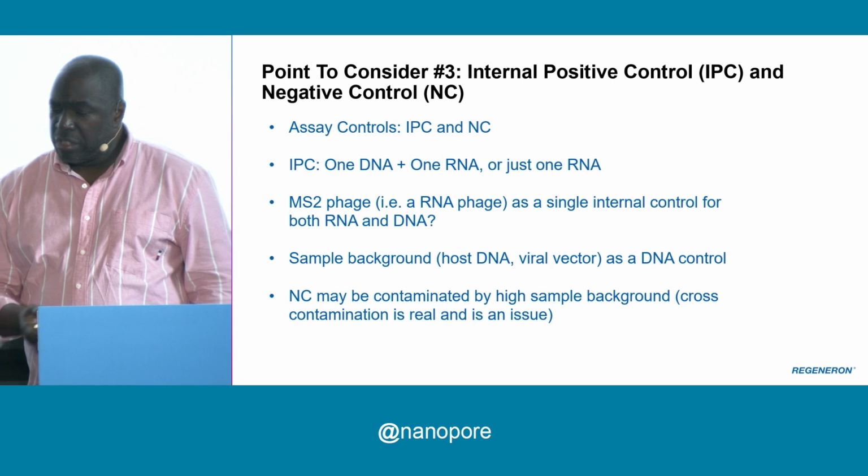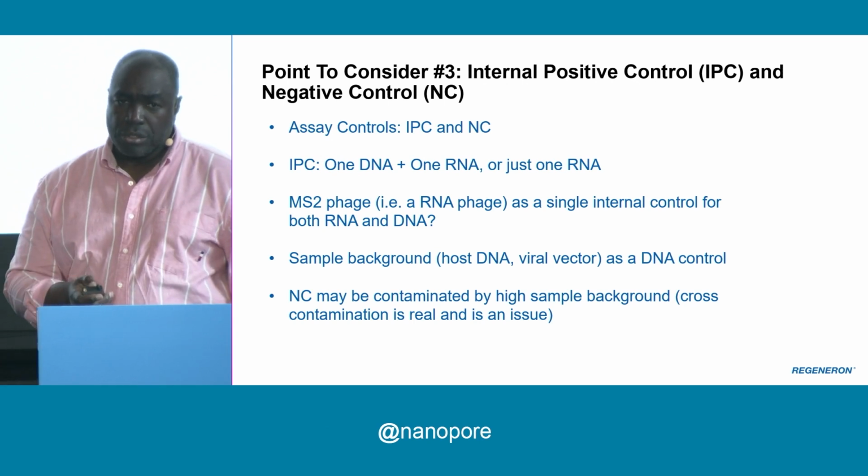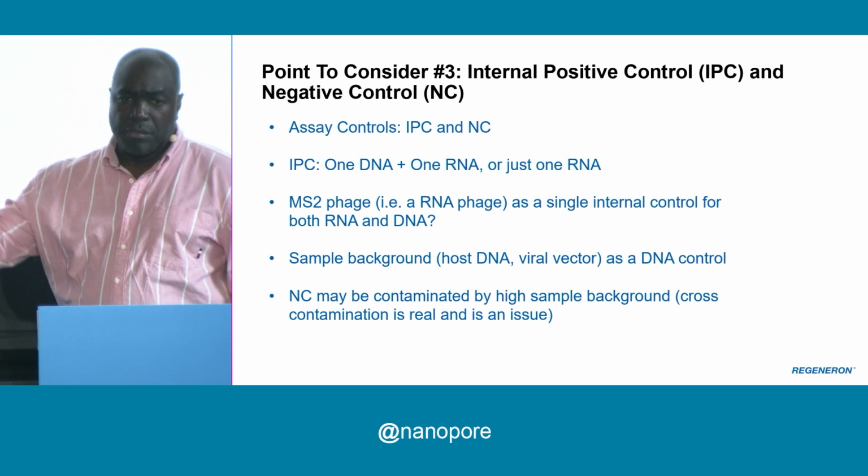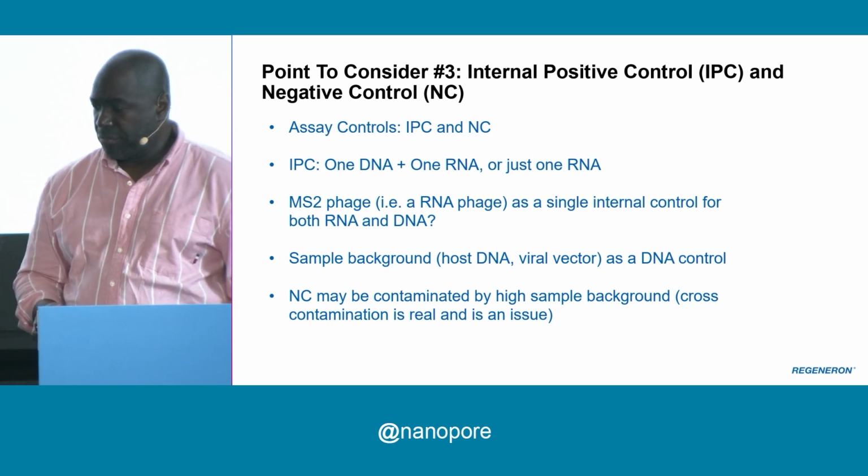A comment on that one: if you're using the PromethION, PromethION has more sensitivity than the GridION, so maybe on that one you don't need pre-amplification.